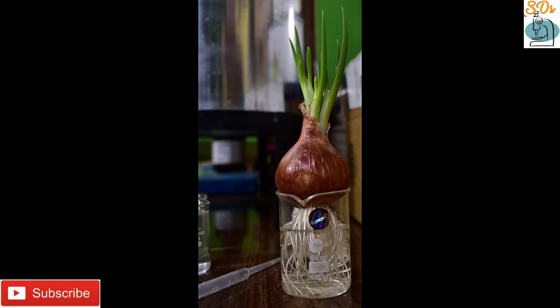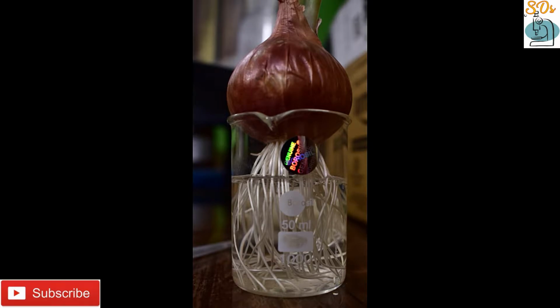An onion root tip is a rapidly growing part of the onion and thus many cells will be in different stages of mitosis. The onion root tips can be prepared and squashed in a way that allows them to be flattened on a microscope slide so that the chromosomes of individual cells can be observed easily. The supercoiled chromosomes during different stages of mitosis present in the onion root tip cells can be visualized by treating with DNA-specific stains like Feulgen stain and acetocarmine stain.